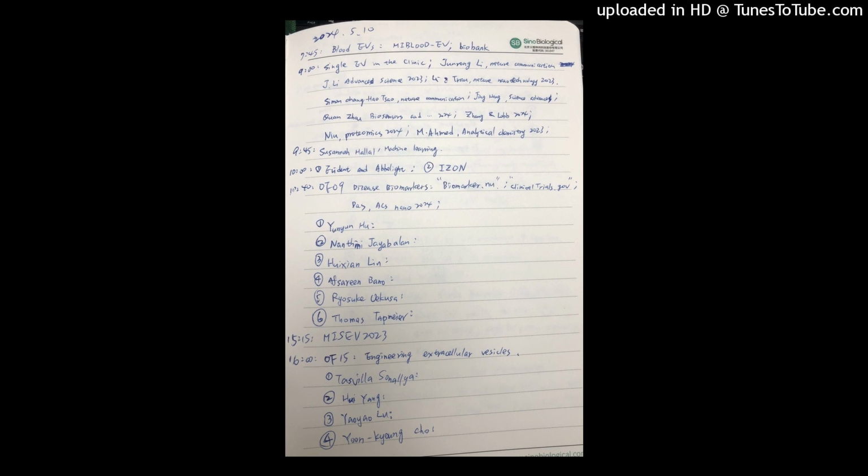Then we looked for biomarkers in these proteins that we were given from the proteomics people. And the ideal biomarker, we thought, is something that's normally not expressed in peritoneal fluid or in blood, ideally. And when in doubt, we would look at peritoneal fluid expression over the proteomics of blood, because you have less sensitivity in proteomics than you might have when you trace these with an antibody. You don't have the same depth in reading protein data. And that means, of course, there have to be antibodies available for these markers.